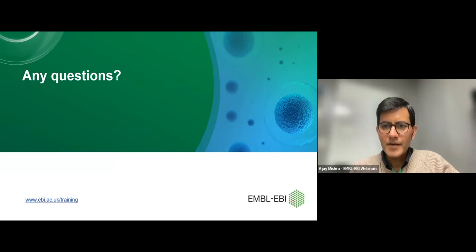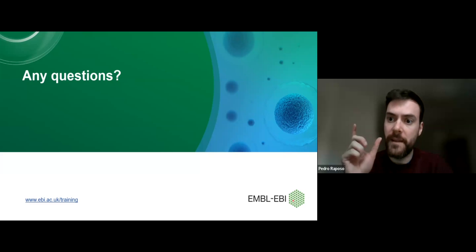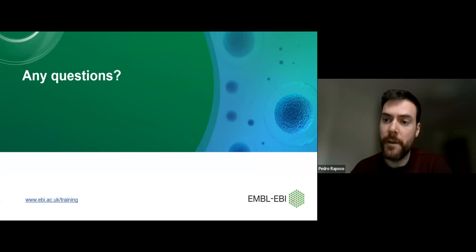Okay, thank you. What is the best approach to analyze features and conserved regions from an alignment of very similar amino acid sequences? Well, after the alignment, you have several options. For example, you can try to understand if there are domains that are common among these.